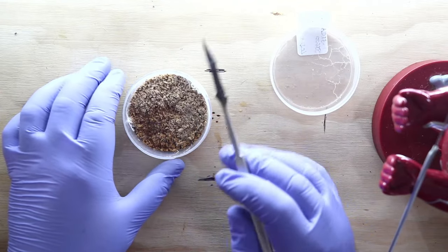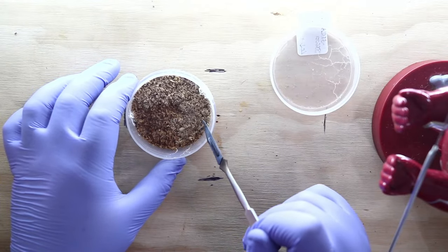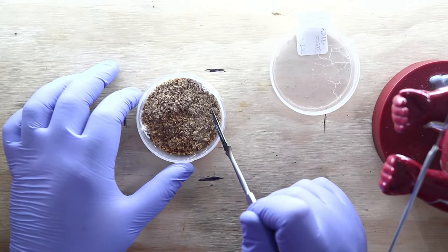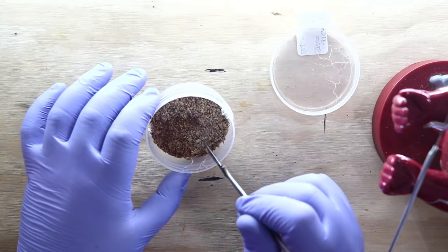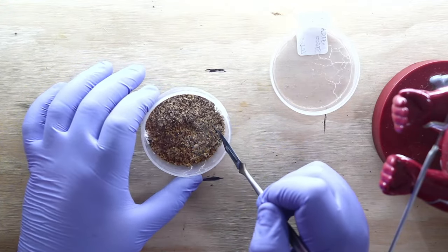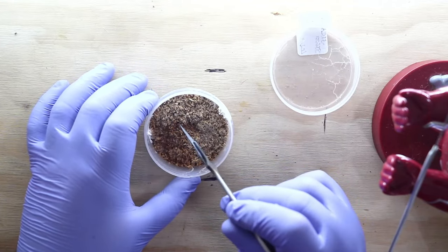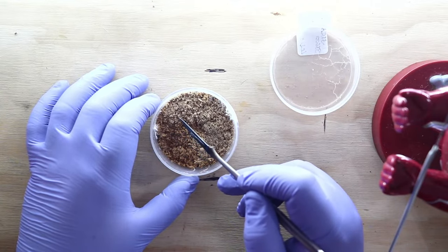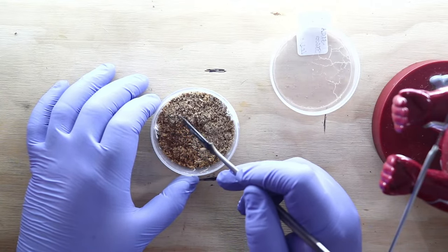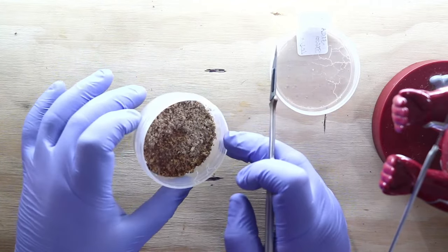Close it up, let it grow, and make sure you mark which side you put it on, please. Because once it grows all the way across, that wedge may be out of water, may be shriveled up, you may not see it anymore. But once it's grown fully across, you can come over here and just scoop some of that myceliated sawdust out and put it back on a plate. I mean, it's so, so simple.